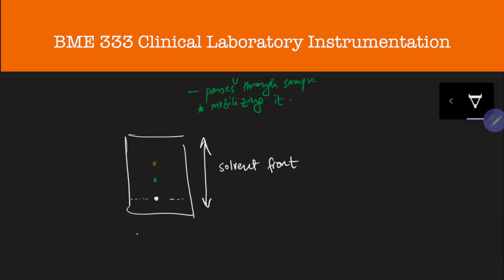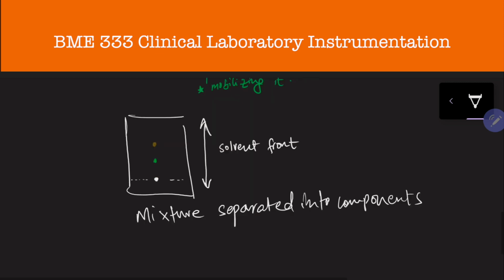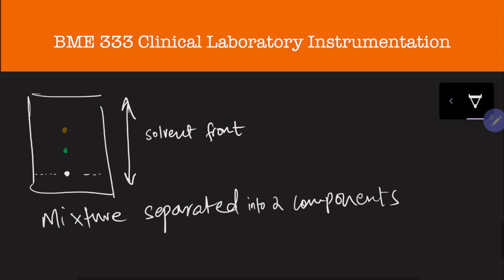It's important to understand that a TLC plate is only a few centimeters long, and there are millions of organic compounds. So it is possible that their spots travel similar distances, and it becomes quite difficult to distinguish different dyes or different compounds, as they could appear very close together. That could be a problem in itself.